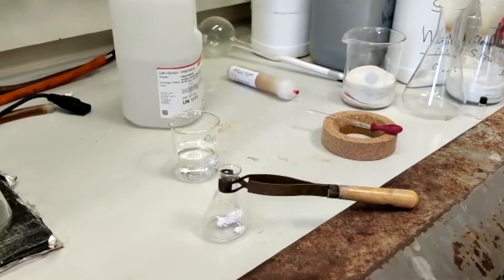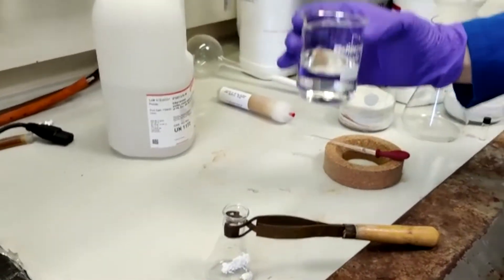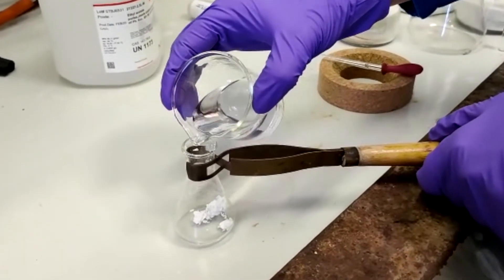So all you want to do is take ethyl acetate in this case, we'll add about 10 to 15 milliliters. And then we're going to use a heat gun to heat this up to boiling.